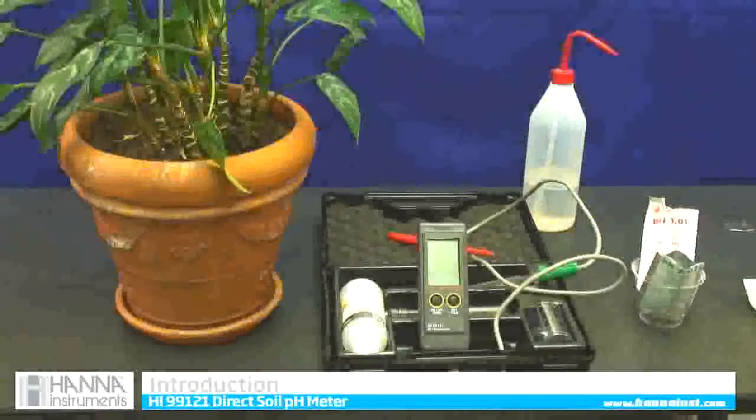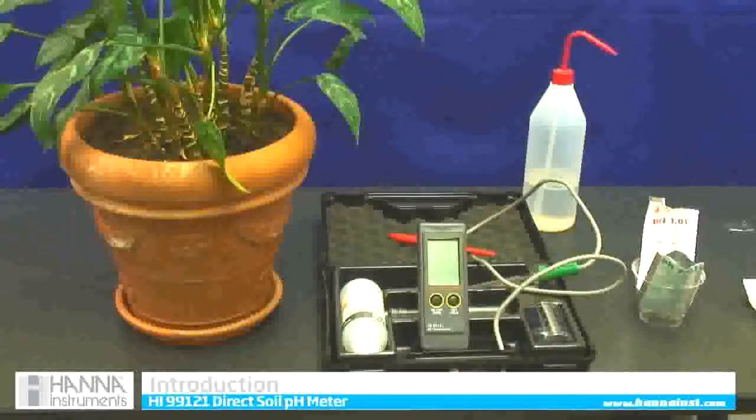This is a Hanna's Instruments HI-99-121 direct stick soil pH meter. It is very accurate. I had it tested by the University of New Hampshire, and the reading you receive on this is the same reading as if you get from your soil lab.